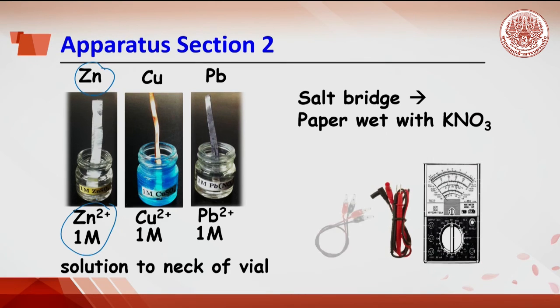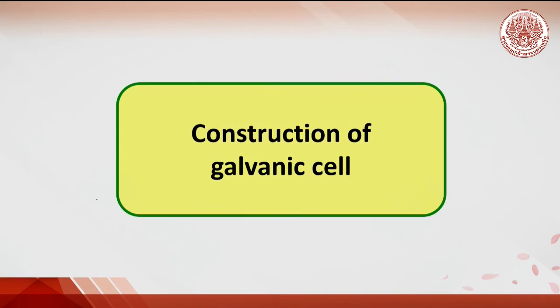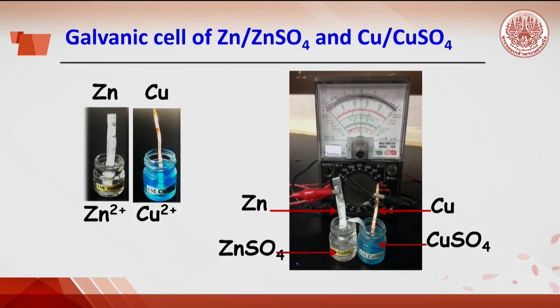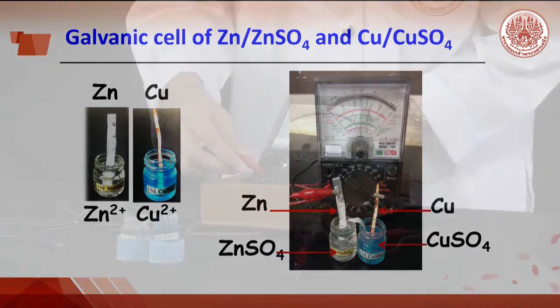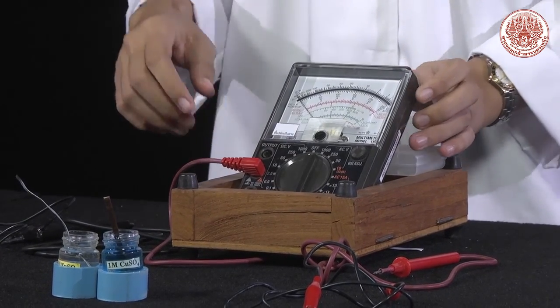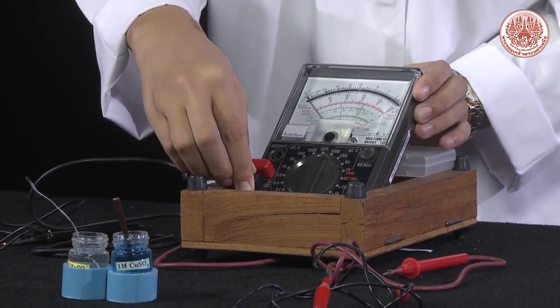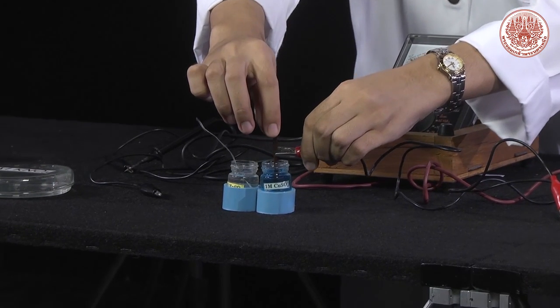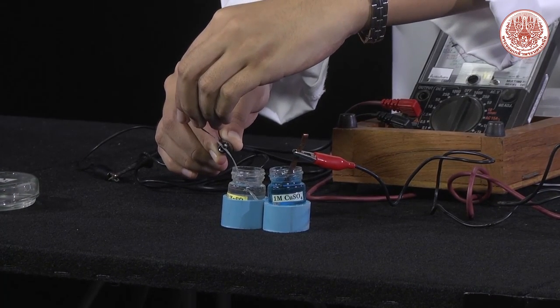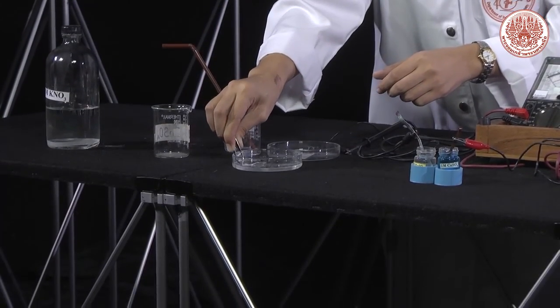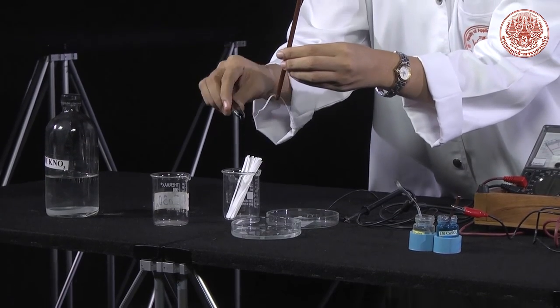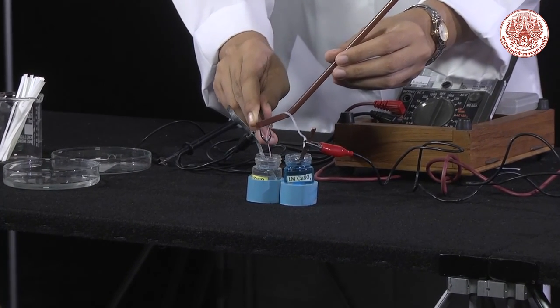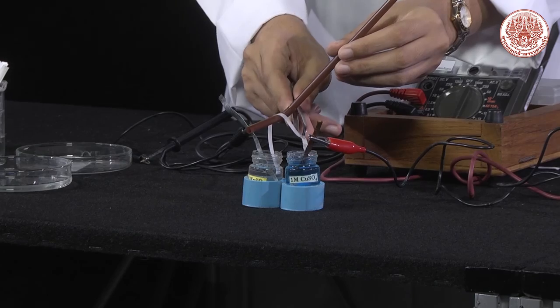The red terminal of the multimeter goes to the positive jack and black goes to the negative jack. Connect the ends of the leads with alligator clips connected to the electrodes. Prepare a salt bridge by soaking a paper strip in 1 molar potassium nitrate solution. Place the salt bridge across the two half cells. Make sure both ends of the paper strip are immersed in the solution.